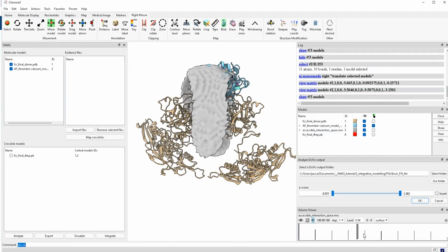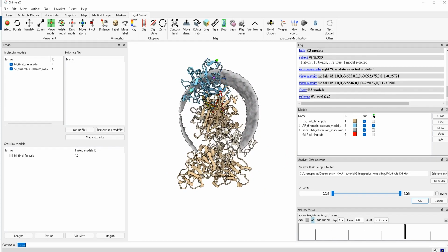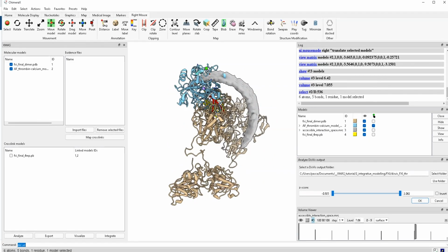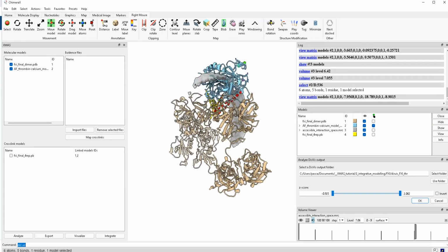if we reduce it, it points to a circle around it, because in the end we have a very defined point, but our molecule could be accessible from different sites, and all of these are actually compatible with the distance restraints we put.